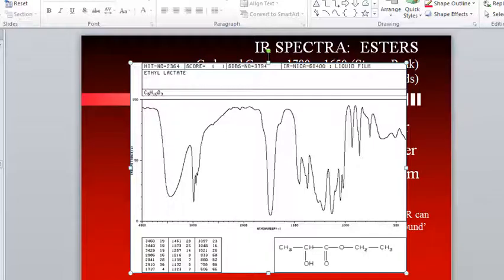1000 to 1300, and I see a peak here at around 1025, I see a peak at around 1050, I see a peak at around 1150, I see a peak around 1200, I'll see a peak around 1250. There's multiple peaks that are happening here, right? So which one of these are important? I just simply can't put my finger on it. I don't know which one is which.